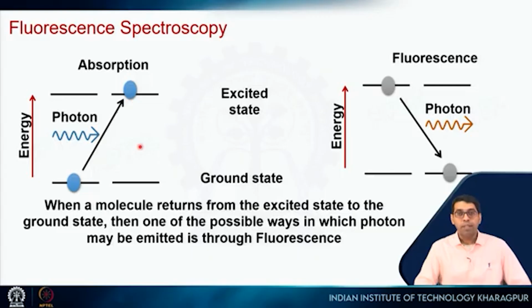So, apart from that, the same chromophores can also be used for fluorescence studies. So, what is fluorescence? You have your chromophore, you can give energy. So, we are incidenting some light and it goes to the excited state. Now, it can come down through various radiative processes. One of those is fluorescence, and you measure whatever photon is emitted.